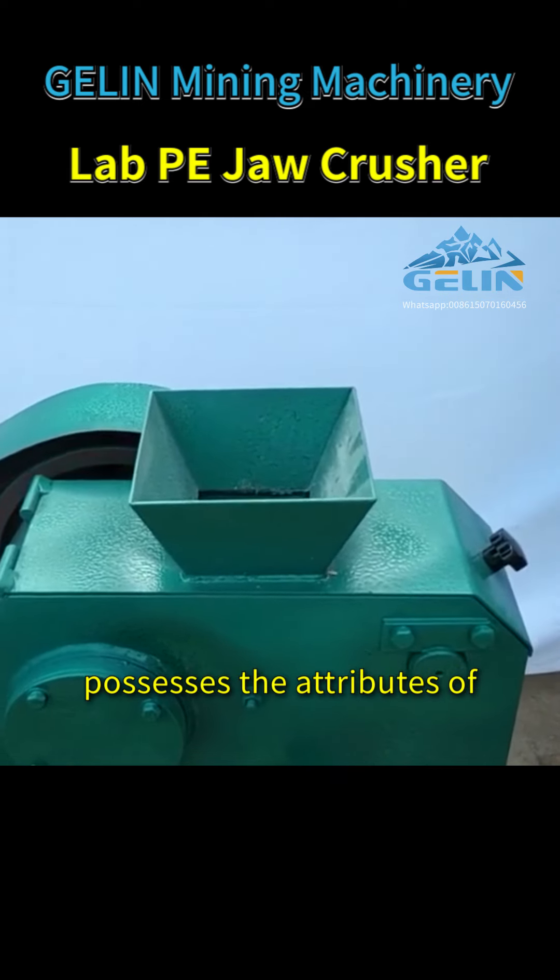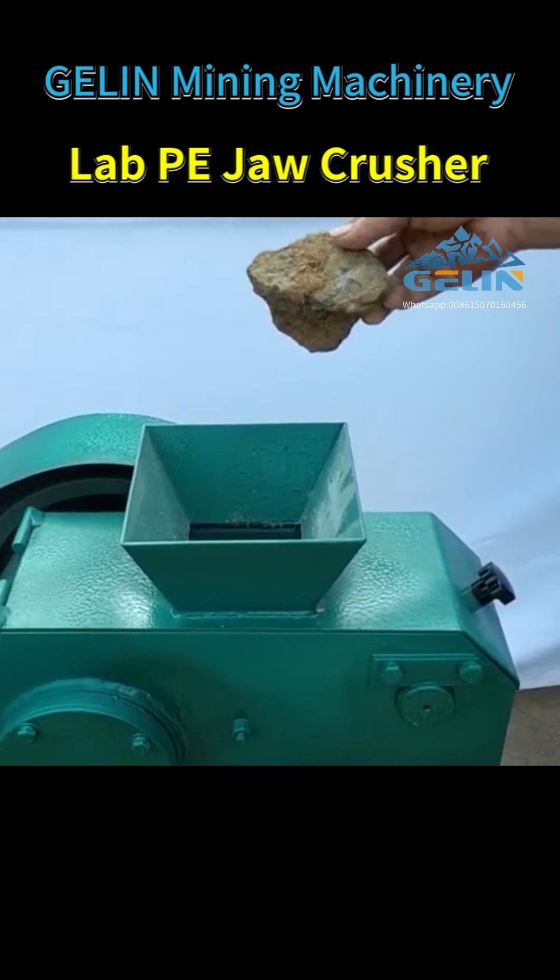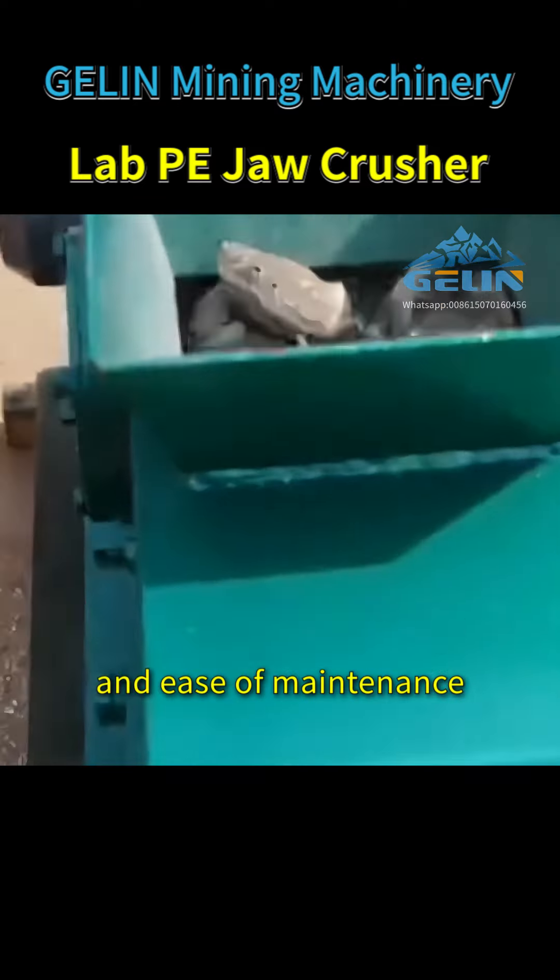GELIN Lab PE jaw crusher possesses the attributes of a large crushing ratio, uniform product size, a simple yet reliable structure, and ease of maintenance.